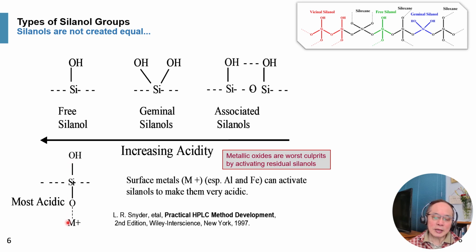It turned out that in the 70s and 80s, a lot of the silica material was coming from minerals which are mined and then sifted to give you the right size. So they are not synthesized, and the purity is not good, even though the particles are very strong, with metallic oxide.